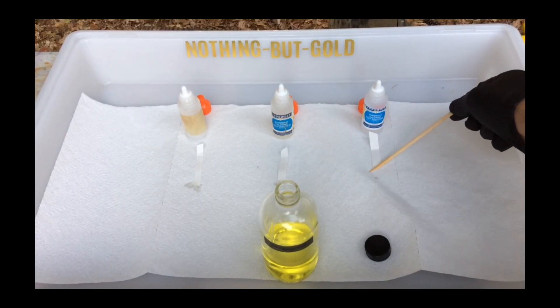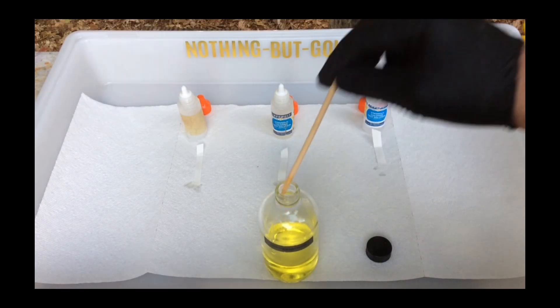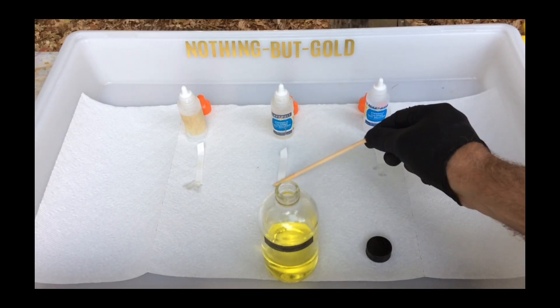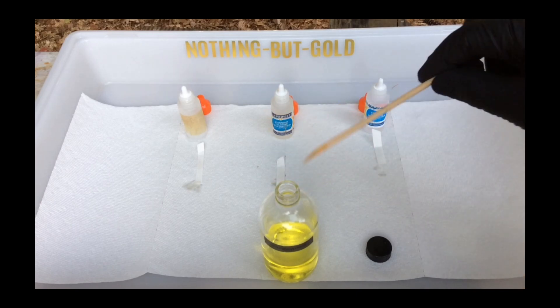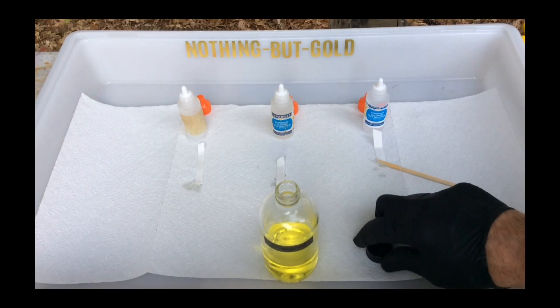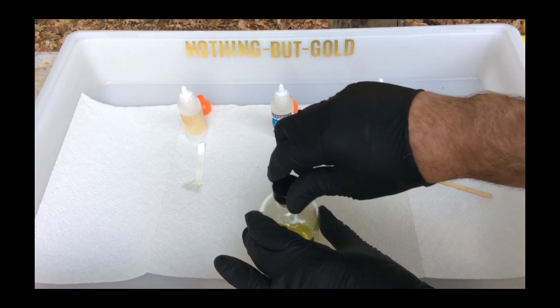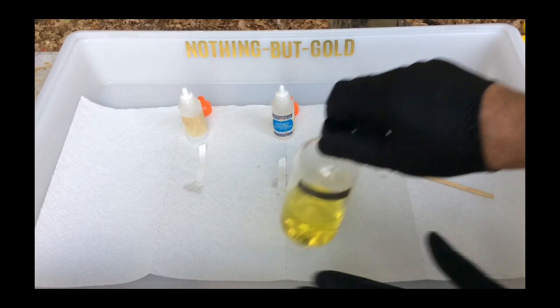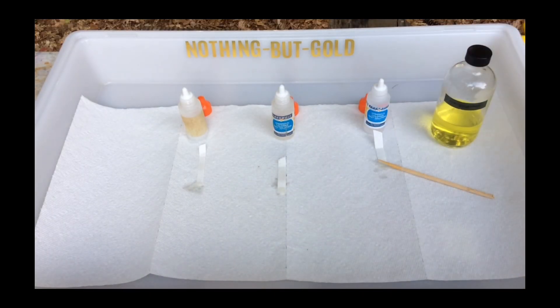In the video, you can see me taking a small sample of chloro-auric acid and applying it to a test strip. The chloro-auric acid absolutely 100% contains dissolved gold. I will test each strip with different Stannous Chlorides to determine if they are still usable.